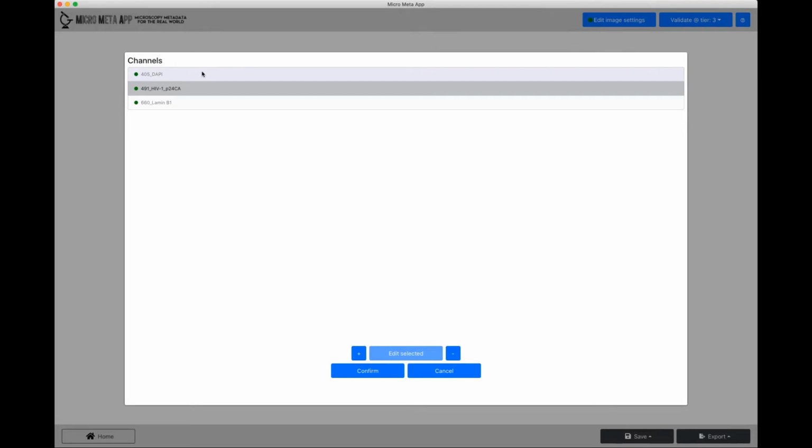In this case, the Settings.JSON file is already completed, and therefore you can see that all the information here are already validated and have a corresponding green validation dot, indicating that all the required information is already present in the file. As an example, I'm going to show you how to take a look at the DAPI channel.